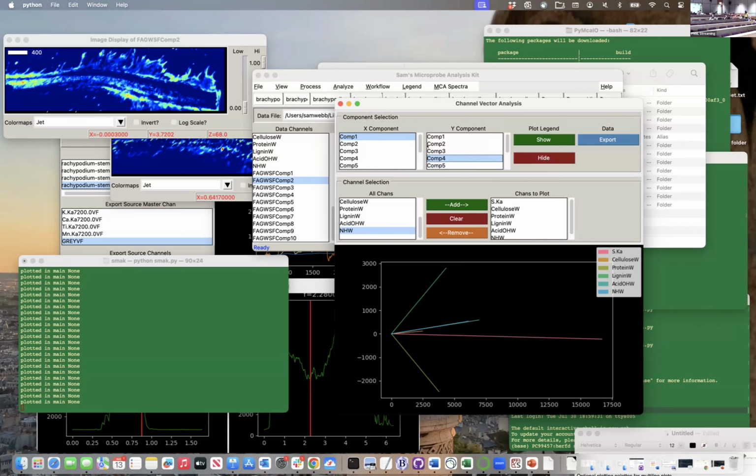Yeah, and to go to that too, someone says, oh, I measured this with my confocal, I did this in fluorescence, and I did this in bright field. These are all great microscopy techniques to help find our areas, but what if I don't have that same technique, right? I'm trying to do better on our beamlines, so we're getting fluorescent LED excitation, so I have like 8-channel excitation on all the beamlines. And so we can go into the UV and put the filters in to see the fluorescence, so I can match your data better, right? And so this is the thing of thinking, we need to get our tools to match so that we can see the right things to correlate with.